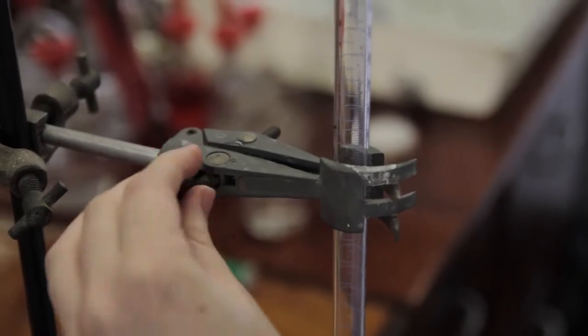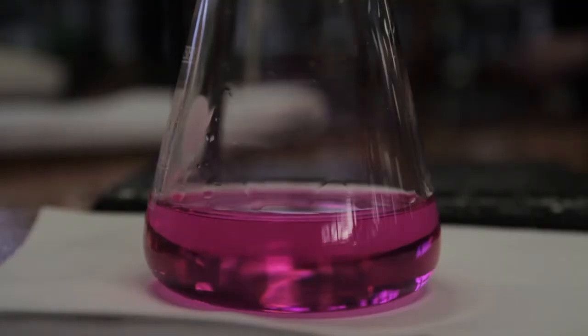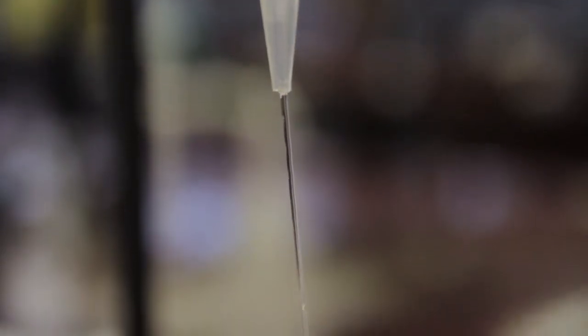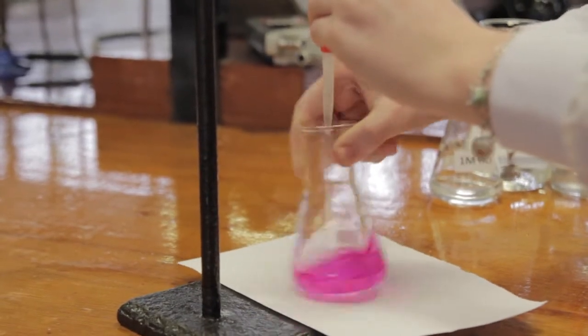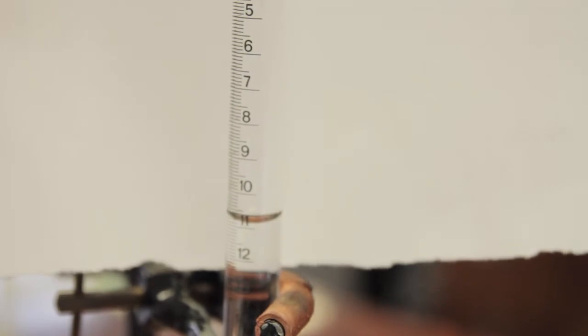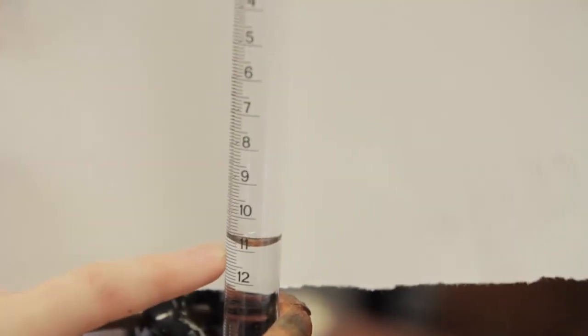Now we are ready to carry out our titration. The conical flask contains a pipetted volume of one chemical and a couple of drops of indicator. First, a rough titre is determined by allowing liquid to flow quickly from the burette until colour change is noted. This is an estimate of the volume of this compound needed to neutralise the compound in the conical flask.